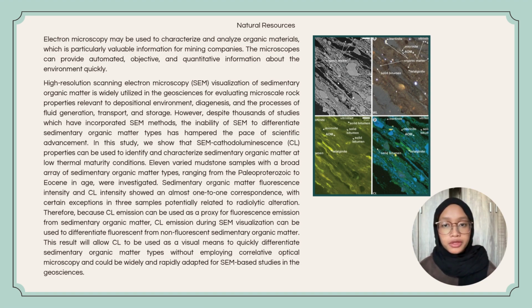Another example is use in natural resources. The electron microscope may be used to characterize and analyze organic materials, which is particularly valuable information for mining companies. The microscope can provide automated, objective, and quantitative information about the environment quickly.